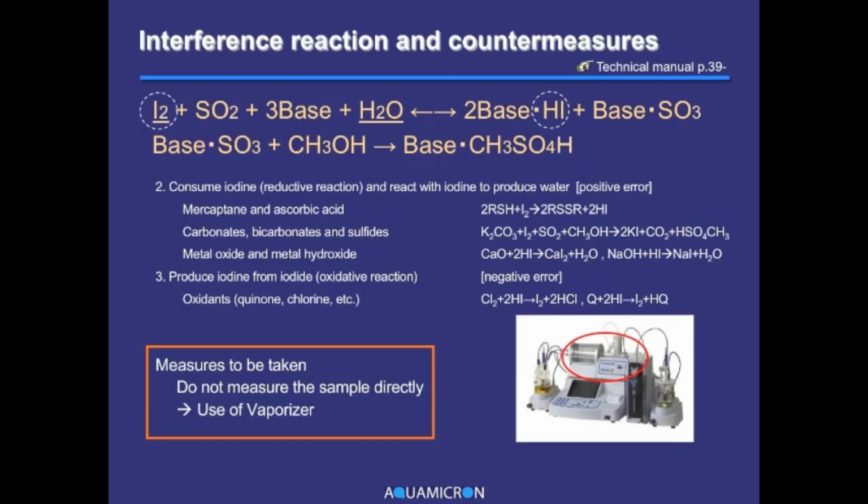Other types of interfering substances are listed in the technical manual. Since the Karl Fischer titration is based on a chemical reaction, some substances exist for which the water could never be measured with this titration.